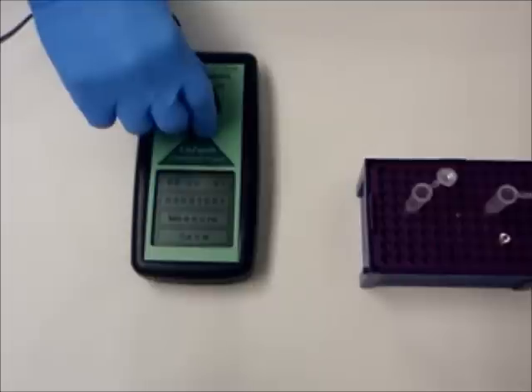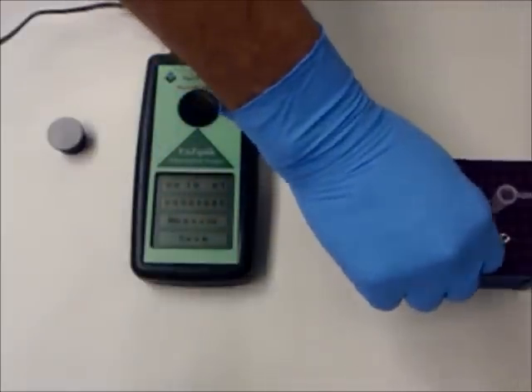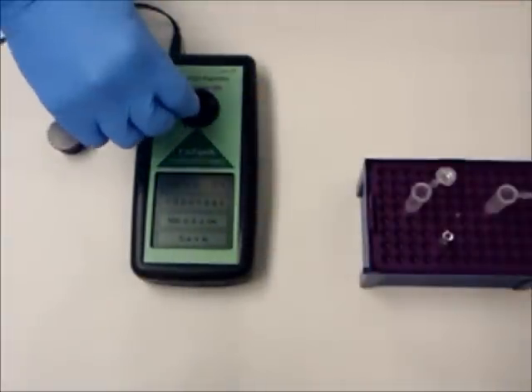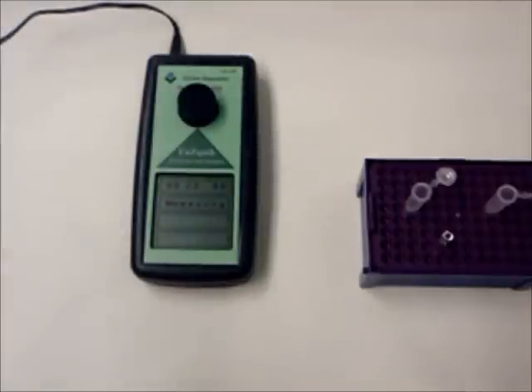Remove the control and place the sample small glass testing tube into the fluorometer test chamber and replace the cap. Push the measurement button on the touch screen and record the result of the sample.